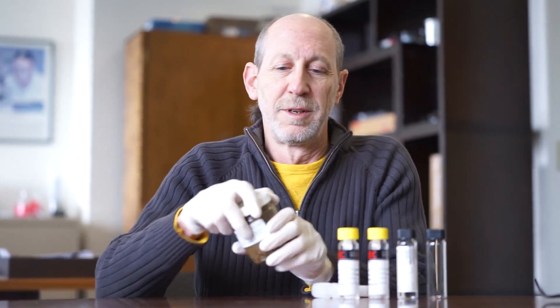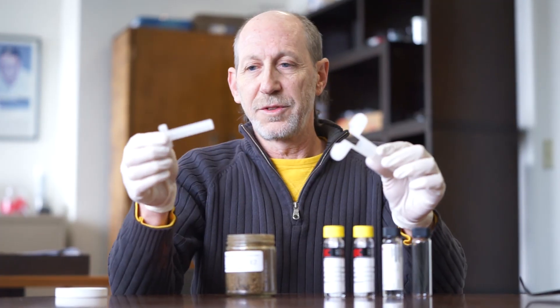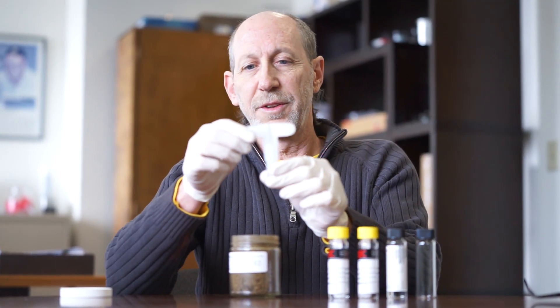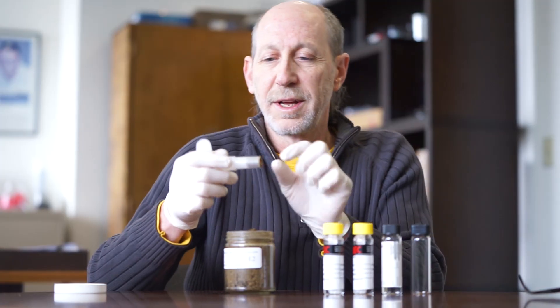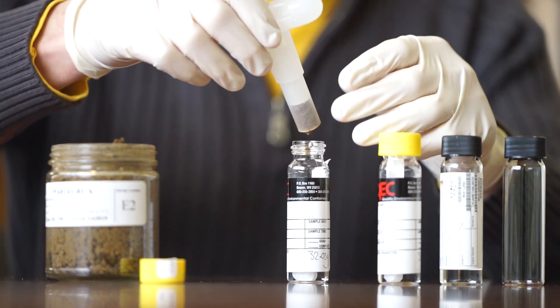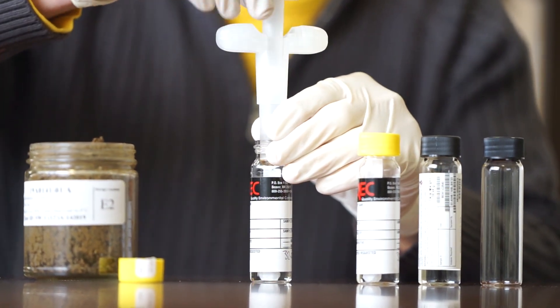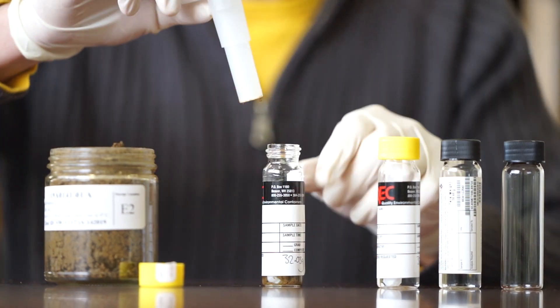Very simple to do. You take your soil, take the two pieces together like such, jam it in here. You collect this bottom inch of soil. Position the TerraCore over the vial, take the inner piece, turn it, push it all the way down, and expel the dirt.